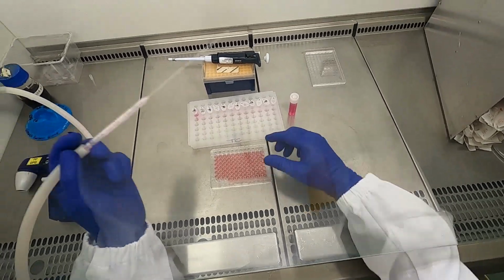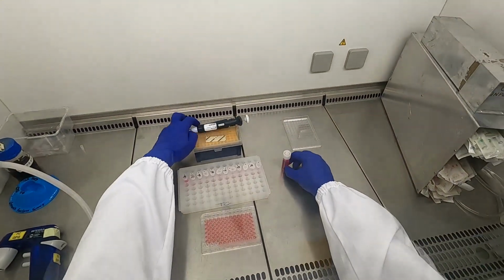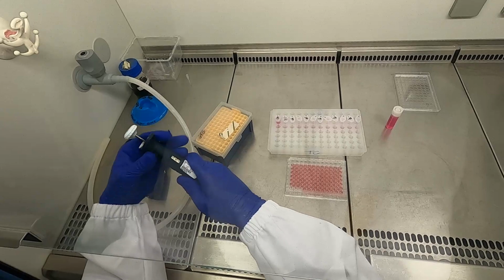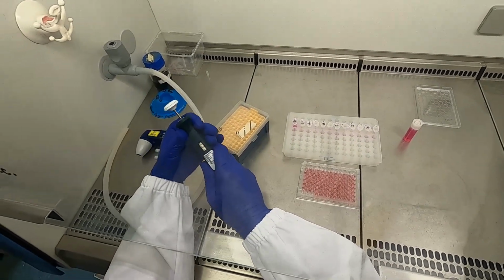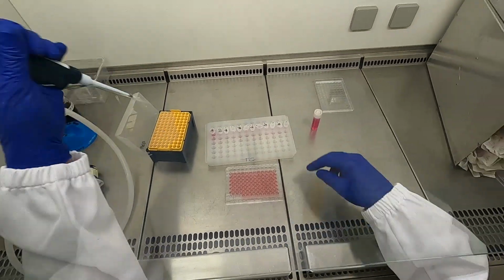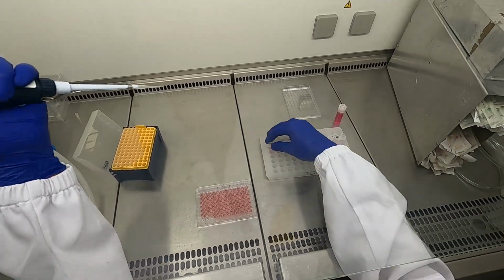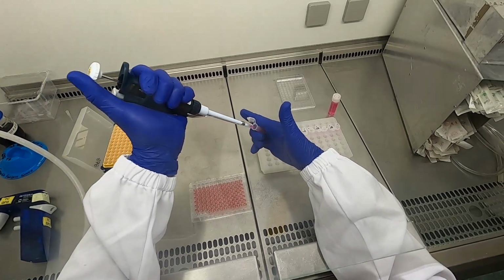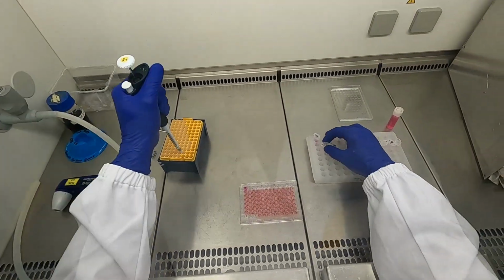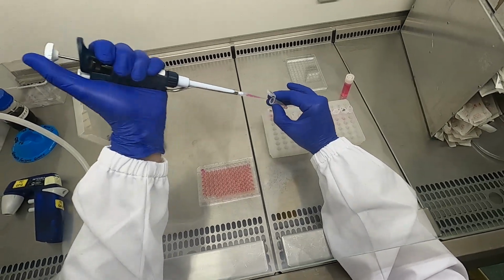Okay, the cells are now exposed to air. They really don't like this very much. So it's important to quickly get the medium on top of the cell. So set your pipette to 200 microliters, take a new tip and start pipetting those dilutions onto the plate, into each well. 200 microliters at 10 to the minus 8 molar in A1, new tip, A2, 3.16 times 10 to the minus 9 molar, and so forth.